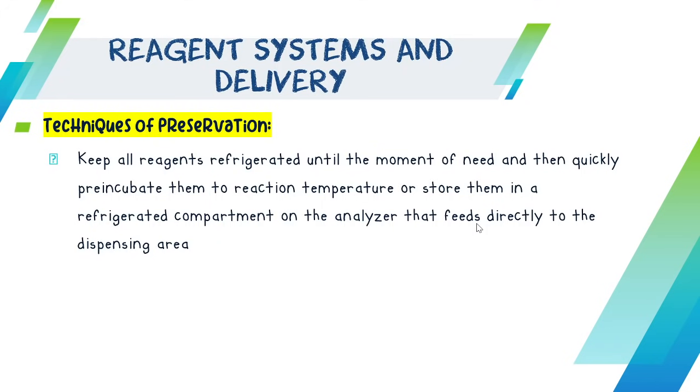There are some reagents, and this is actually a common mistake of students or interns because they are always in a hurry. Even me personally, during my work in the laboratory, there are times that I forget this part: by the time that you remove your reagents from the refrigerator, do not immediately use them. As mentioned here, pre-incubate them, you need to let the coldness of your reagent go away, because temperature could actually affect the processing of your results.